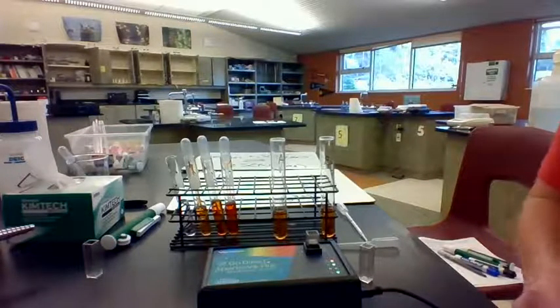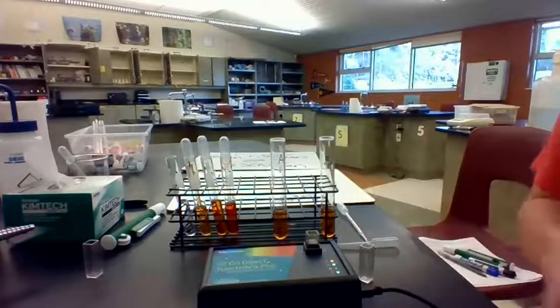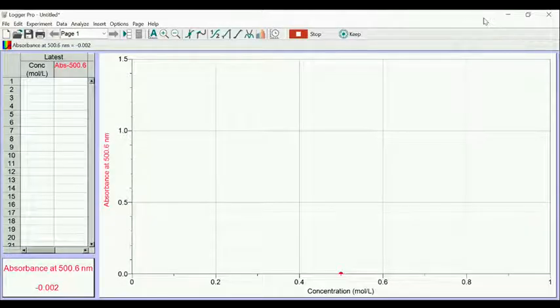All right, so I'm going to switch views, and I will show you what the absorbance readings are for these 2. Now we are going to measure the absorbance of these 2 solutions. So you see right now the readout here from the spectrophotometer, and I'm placing solution A in right now. And there is a readout down here on the bottom left. So it looks like the absorbance for mixture A is 0.600, 0.599. It seems like it's fluctuating by 0.002.